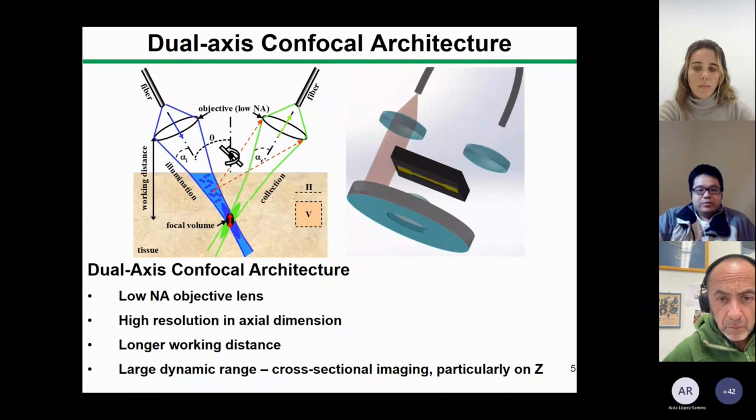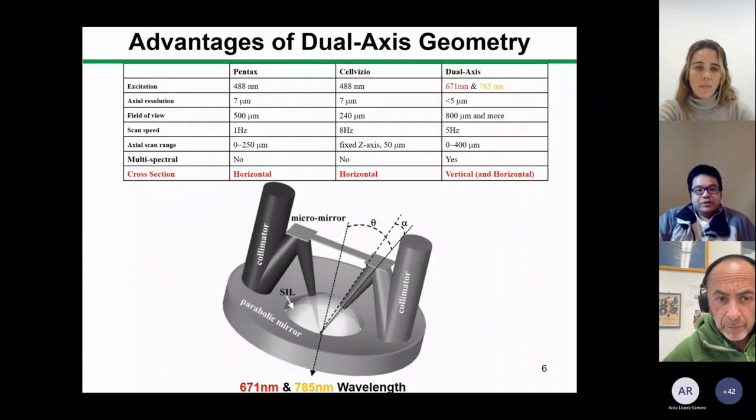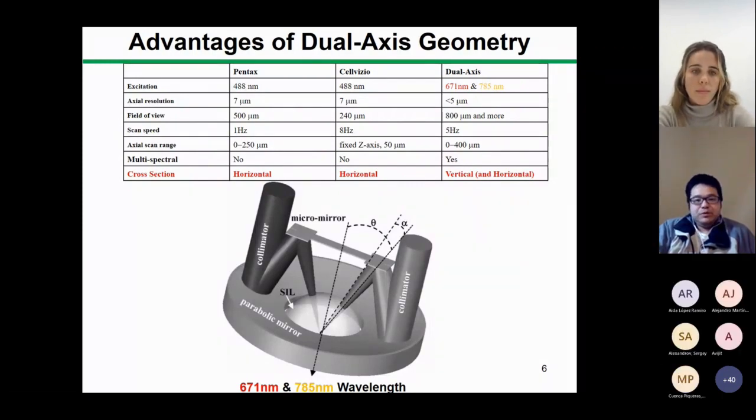At the beginning, we tried to miniaturize the system. We use a MEMS scanner, and the collecting side uses a PMT or single photon detectors. The scanner we developed uses electrostatic actuation. We're also working on other modalities, for example thin film piezo and electrothermal scanners. The beam can be pushed by the micromirror deep into the tissue based on the post-objective design, with the scanner close to the specimen.